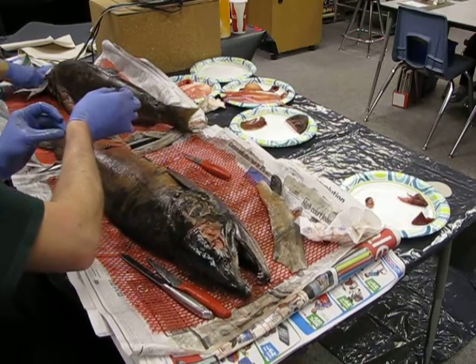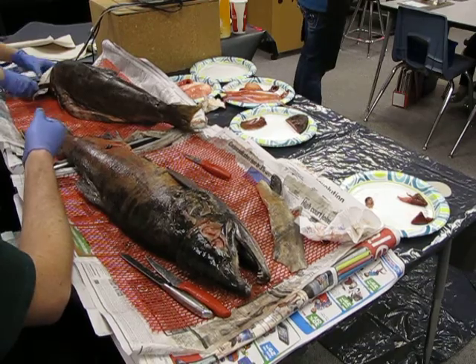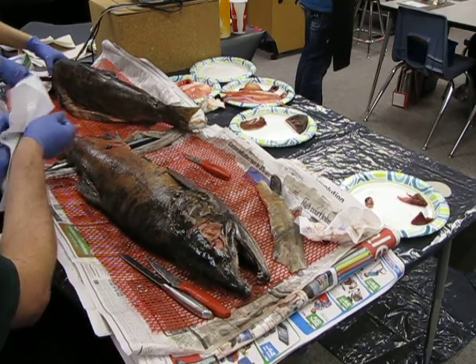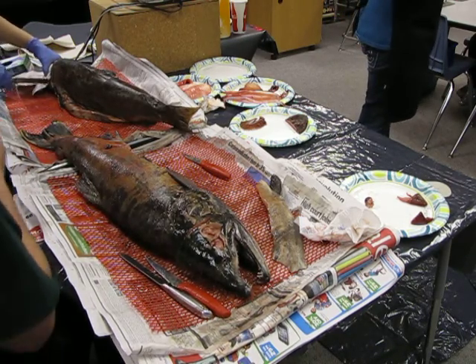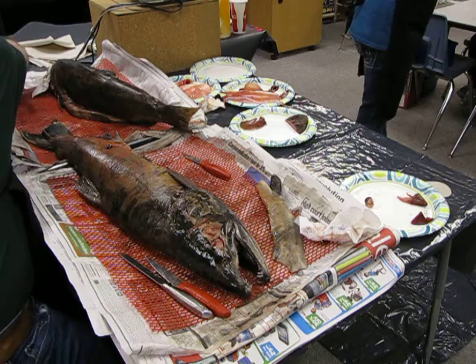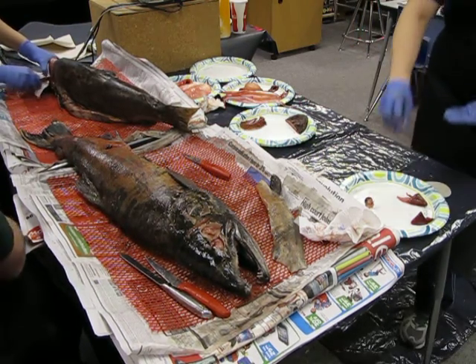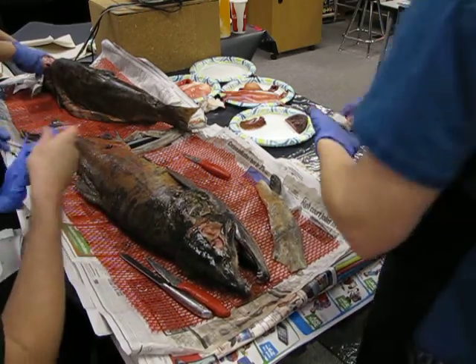Alright. Boys and girls, look at your neighbor's eyes. They kind of look flat in there. Most of our eyeballs sit inside of our heads also. Our eyeballs are about the size of golf balls. Yeah, most of it sits inside of our head. Isn't that crazy?